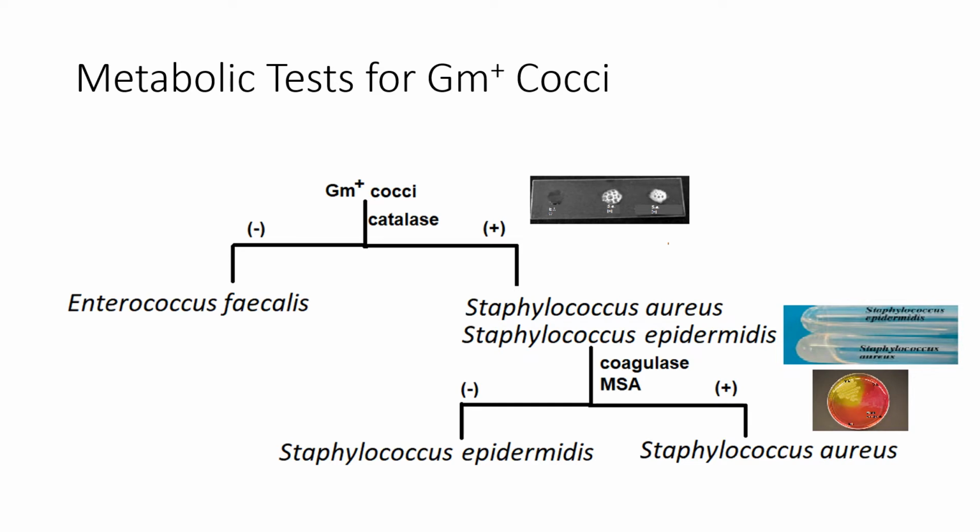Now, one thing to note here: the fact that Staph epidermidis cannot ferment mannitol does not let me say it's an obligate aerobe only. There's a ton of fermentable substrates. I cannot make that determination from mannitol alone. Just because it can't ferment mannitol doesn't mean it can't ferment glucose, or fructose, or any of the other sugars you could come up with.